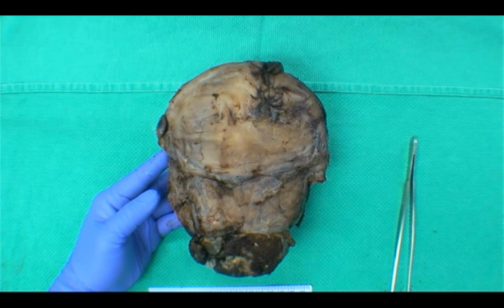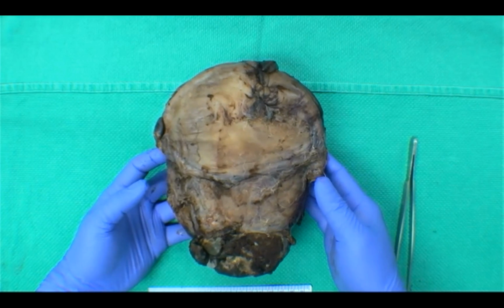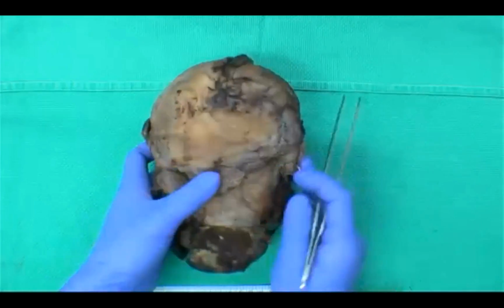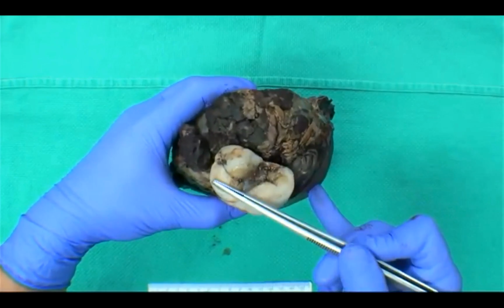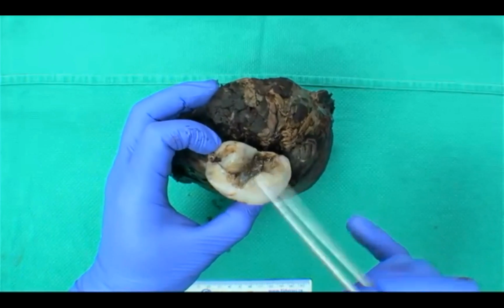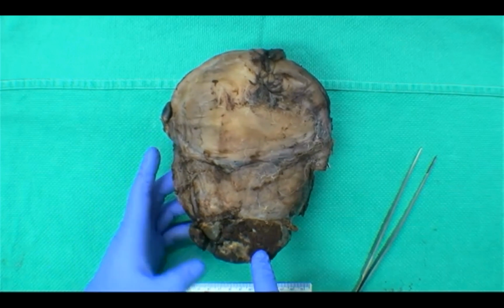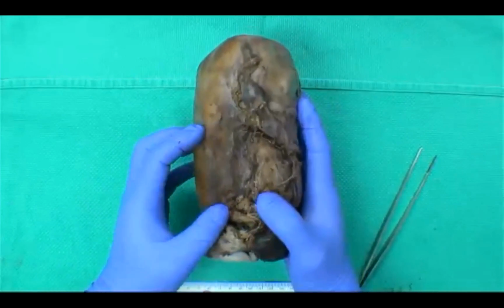So starting off with the basics, you always start with your main measurements and the weight of the specimen. Weigh the specimen entirely. Your general measurements would include the superior, inferior, medial, lateral, and anterior, posterior measurements of the uterus, your cervix in at least 2 dimensions, and mention the size and the shape of the os if you can. And normally when you approach the uterus, you would open the uterus coronally into 2 halves, and have the anterior half and the posterior half.